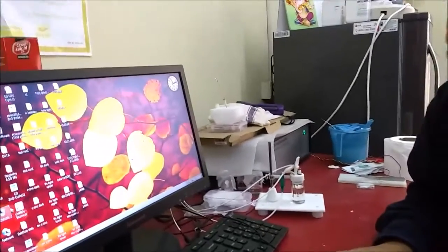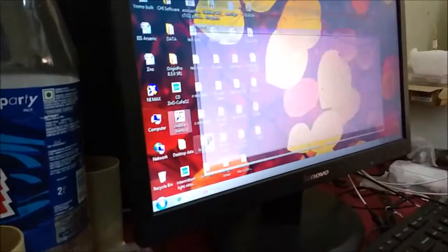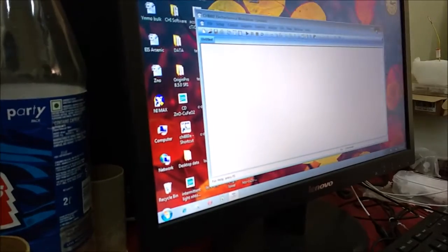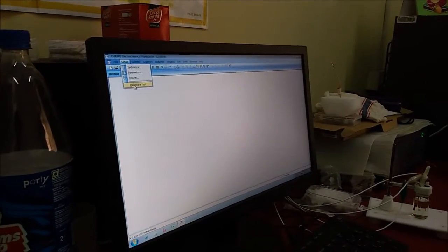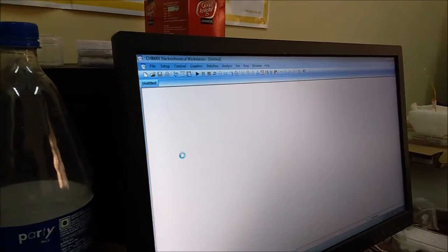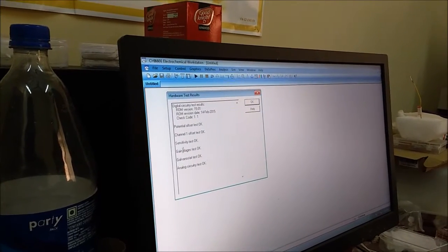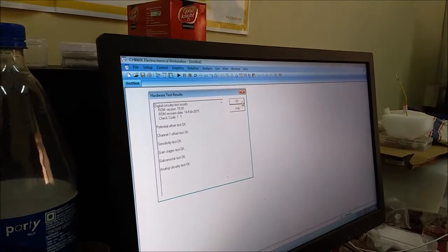Now I will open the CHI 660E software. The machine is already switched on. First I have to do the hardware test. Everything is right.